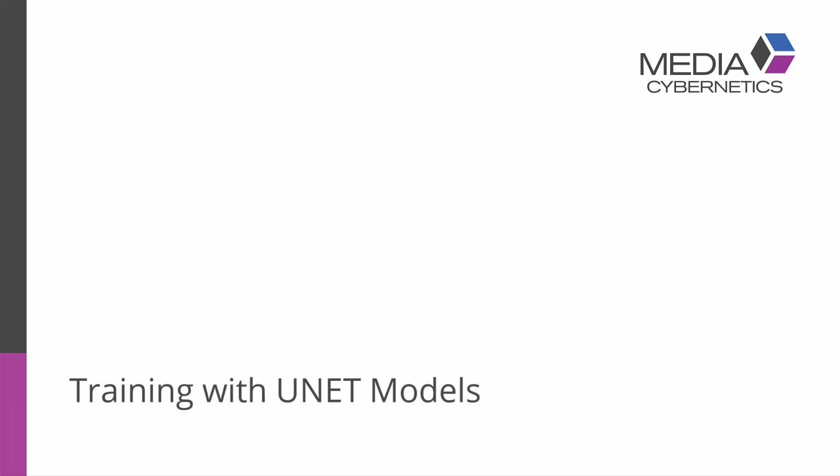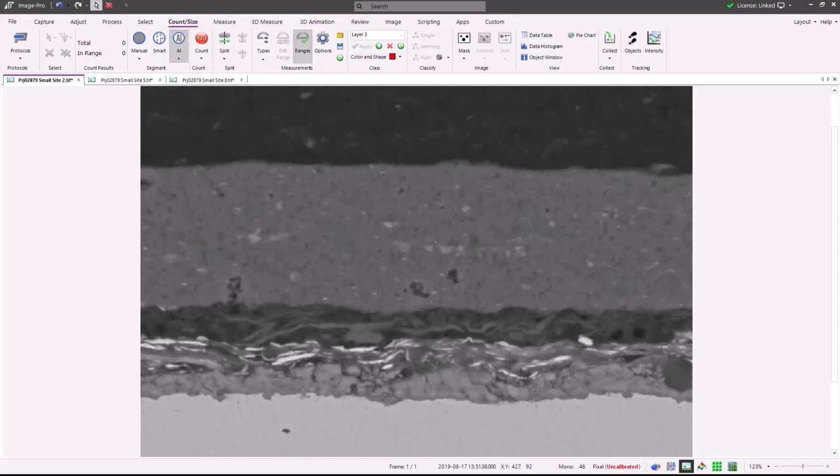In this video, I am going to explain how to train a UNET deep learning model. Normally, I would start with a pre-trained model. However, a pre-trained model does not exist for this type of sample. First, I will select the Count Size tab.